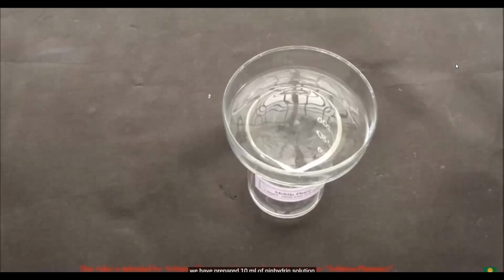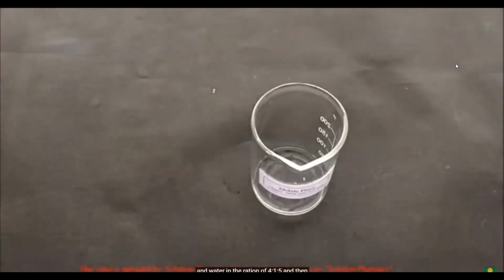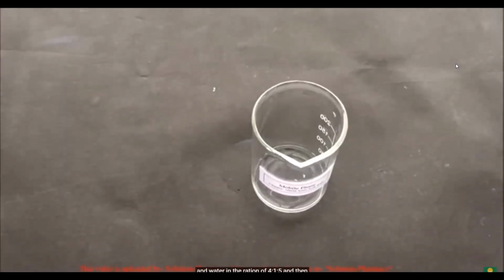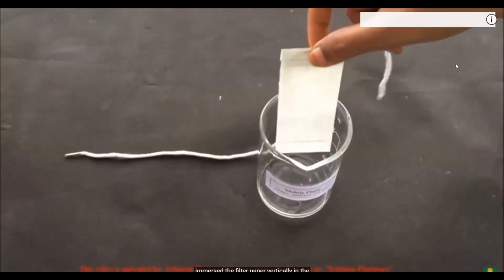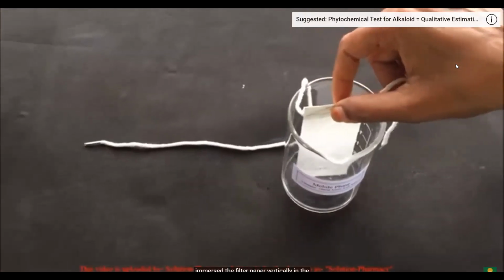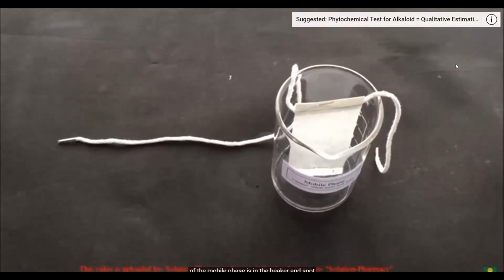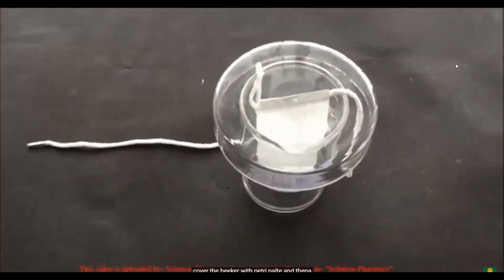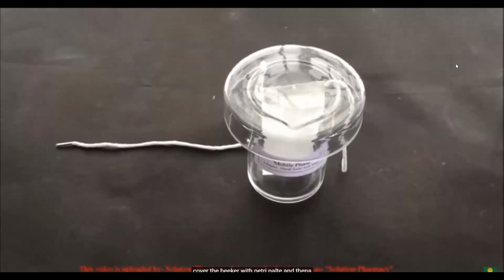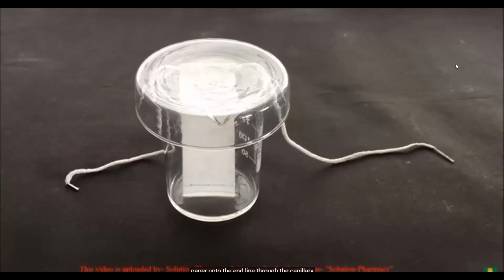Meanwhile, we have prepared 10 ml mobile phase by mixing n-butanol, glacial acetic acid and water in the ratio 4:1:5 and then allowed the beaker to saturate with the mobile phase. Immerse the filter paper vertically in the center of the beaker. Note that the level of mobile phase in the beaker should be such that the spot should not dip into the solvent. Cover the beaker with a petri dish and then allow the mobile phase to move over the filter paper up to the end line through capillary action.